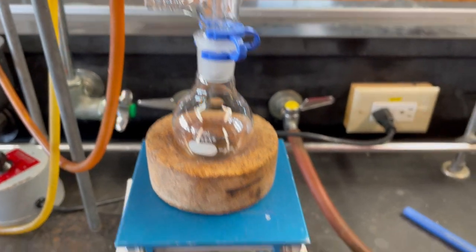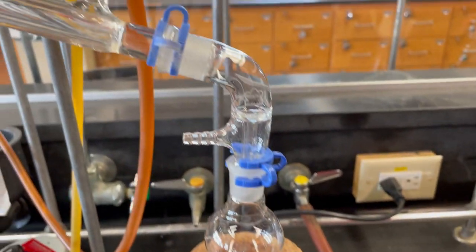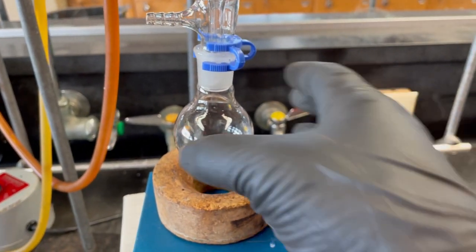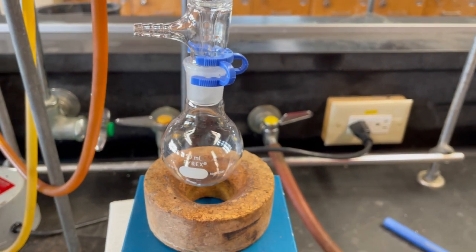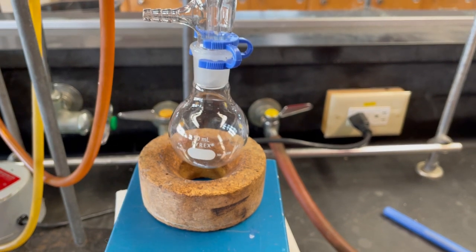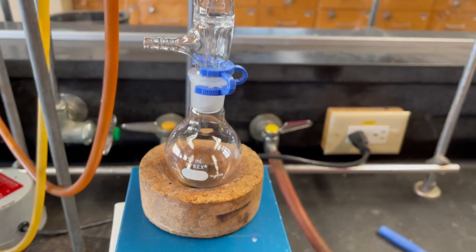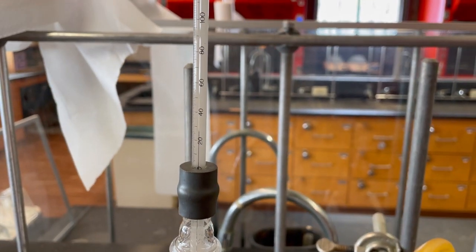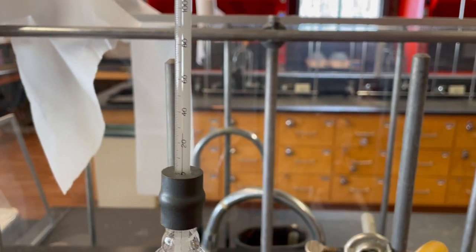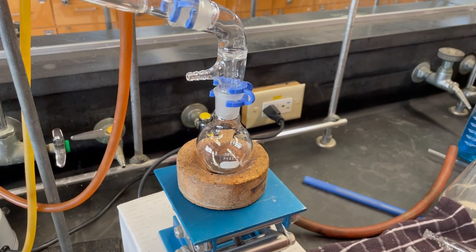And then what we'll do is we can lower this bad boy right here, nice and easy. Notice I have all the clamps in the world on this, so that way I can just take this off and easily replace it with another round bottom flask, so that I can collect my desired ethanol compound. So once that starts to collect, I might do a couple fractions in there, but I want to really make sure that I'm paying attention to this temperature. If I see any changes, then I will immediately switch out my collection flask.